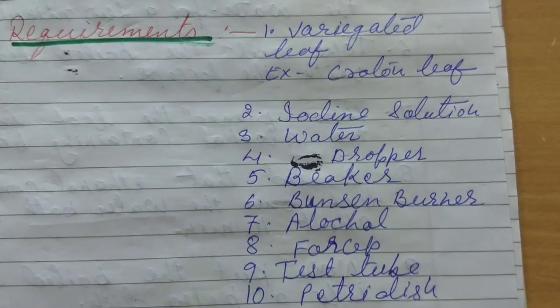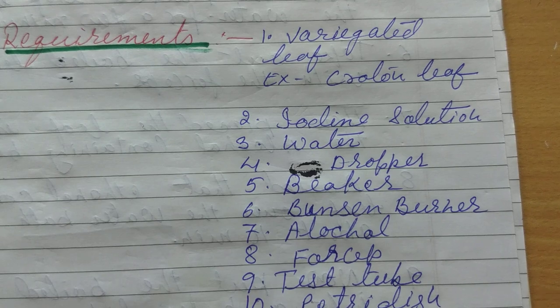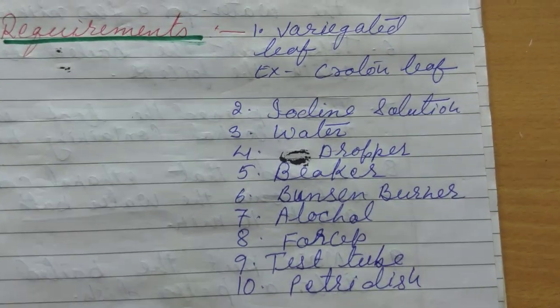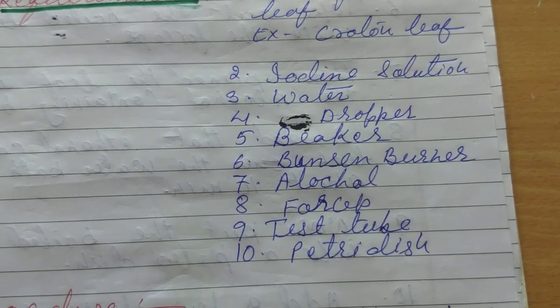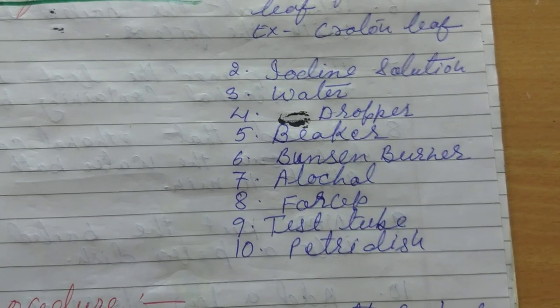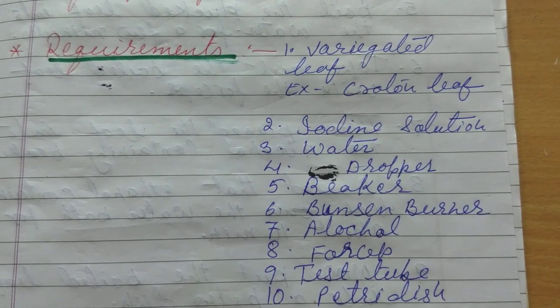The second requirement is iodine solution. The third is water. Fourth, a dropper. Fifth, a beaker. Sixth, a Bunsen burner. Seventh, alcohol. Eighth, a forceps. Ninth, a test tube and a Petri dish. So these are the requirements for the experiment.